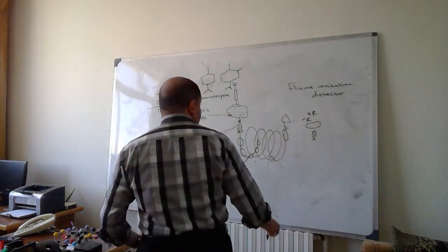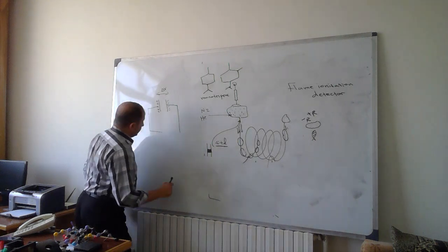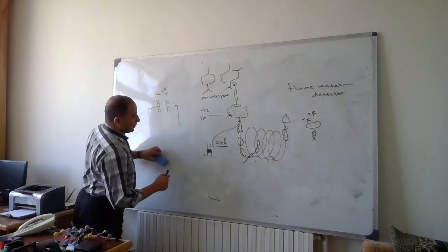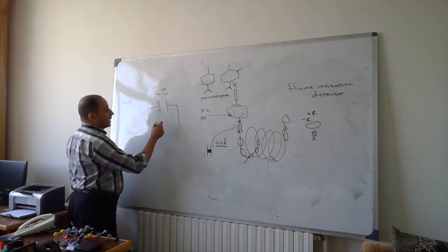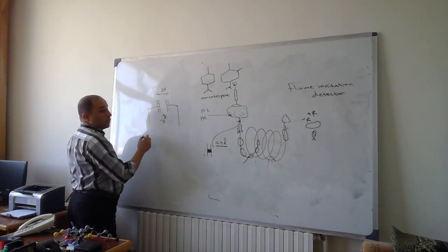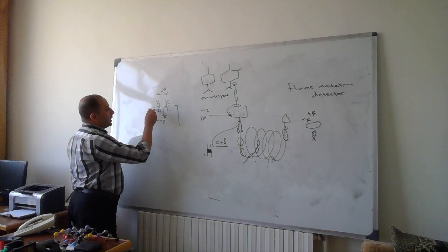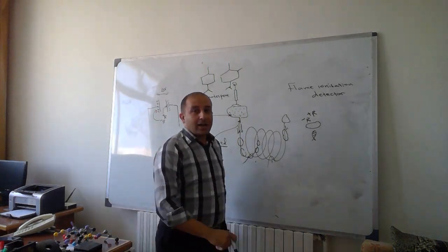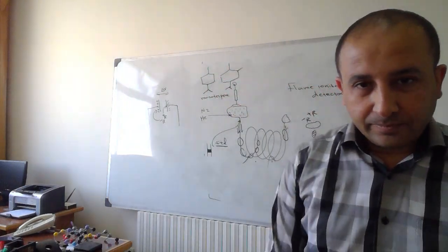But if we have molecules like this burnt by the flame, these cations and anions will neutralize or partially neutralize the charge on the plates.